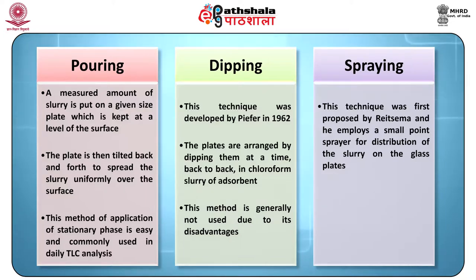This method of application of the stationary phase is easy and commonly used in daily TLC analysis. Dipping. This technique was developed by Pfeffer in 1962. The plates are prepared by dipping them two at a time, back to back, in a chloroform slurry of the adsorbent. This method is generally not used due to its disadvantages.